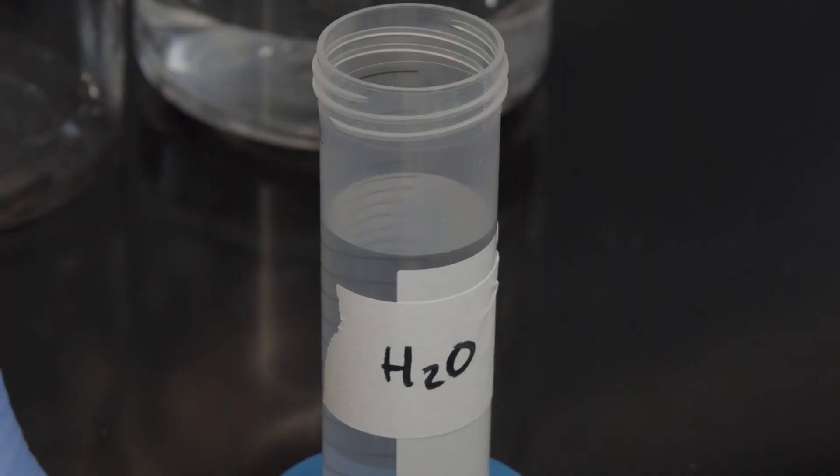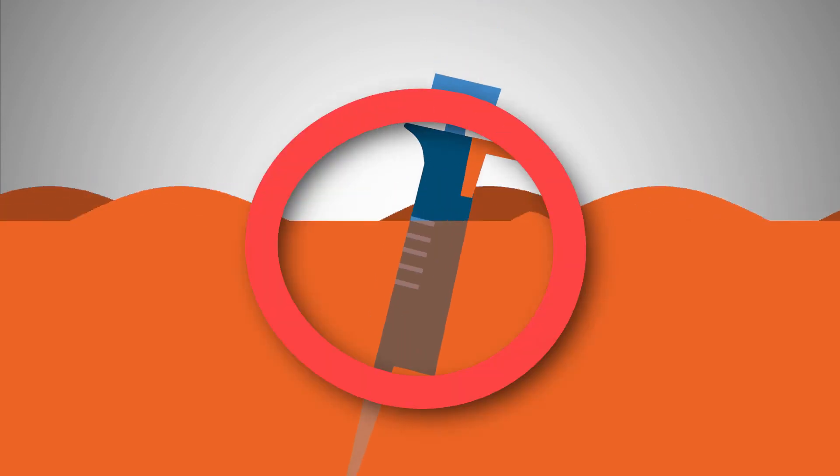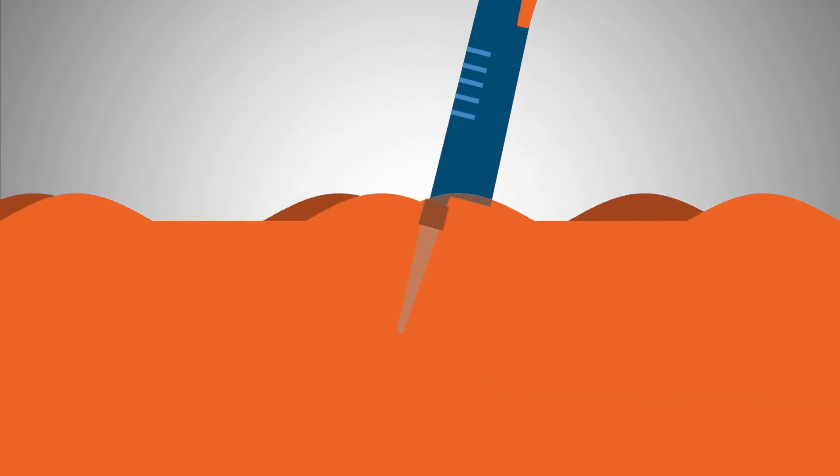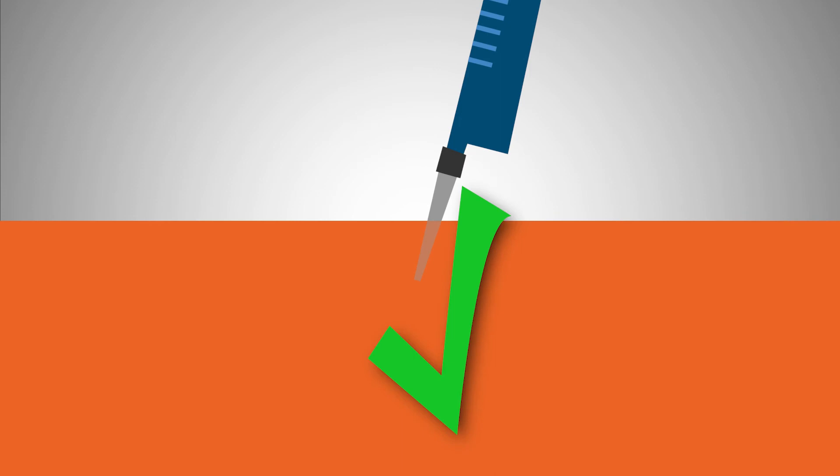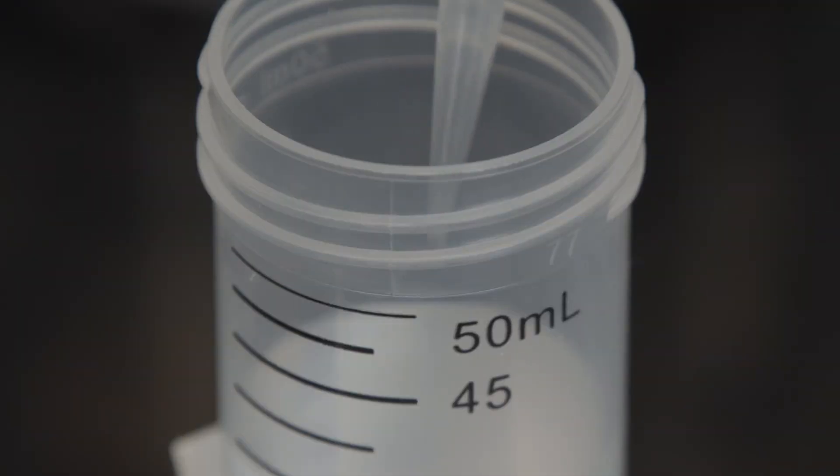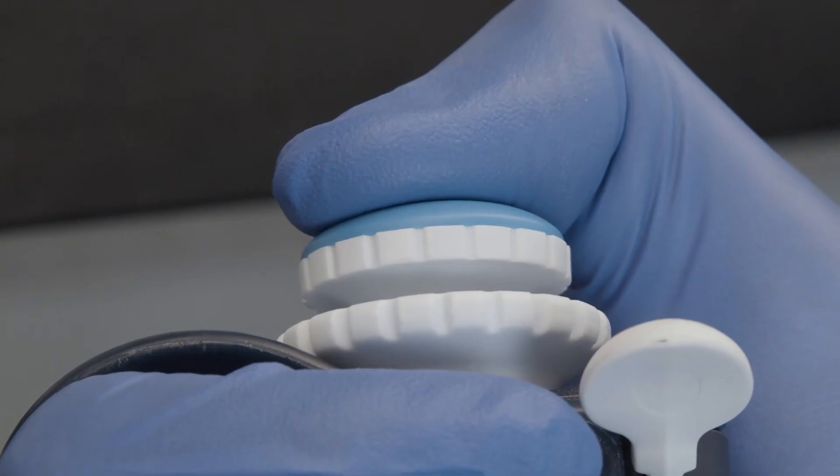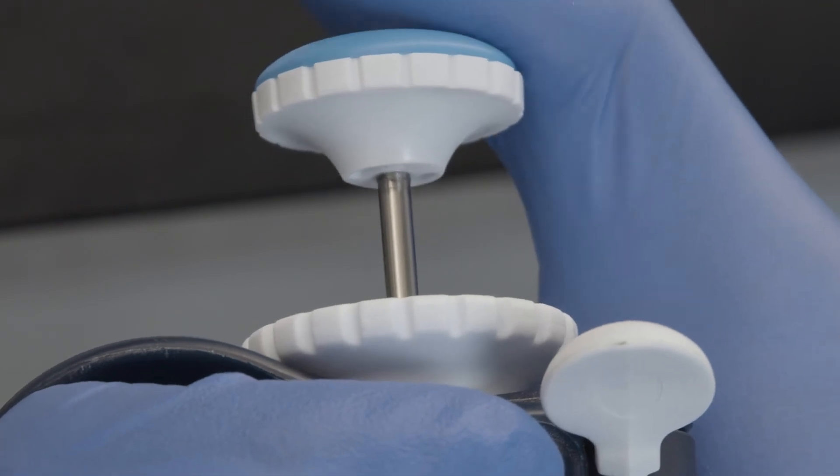Keep the plunger held down and gently lower the tip into the liquid. Do not submerge the entire pipette. Only the tip should ever be submerged into the liquid. Once the tip is submerged, slowly release the plunger, allowing it to go back to its resting position.